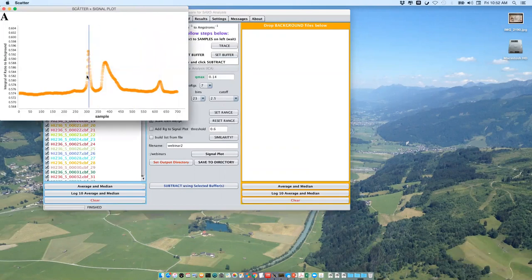And what we again see, as in the previous sample, I expect this already, this is the aggregation peak, where it is very huge. This is the small molecule, and this is exactly what we're expecting, half our molecule of interest. And already from the shape of the peak, you see that it's very non-symmetrical, so it's a very heterogeneous sample, and you're expecting multiple species in the peak.